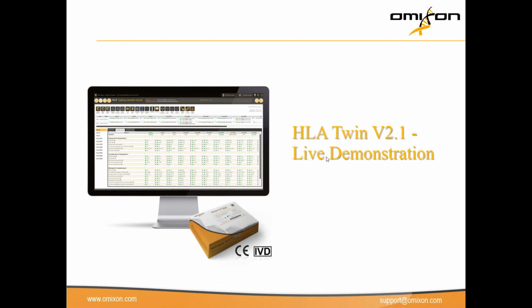I have another question here that is similar actually to the throughput that we were talking about earlier. At what sample throughput do you feel that automation was cost feasible? Well, I must admit we haven't done cost estimations. We felt that this was the right way to go, but I could go and look into it, what the price of the Biomek and the lifetime of the Biomek, but we haven't done that.